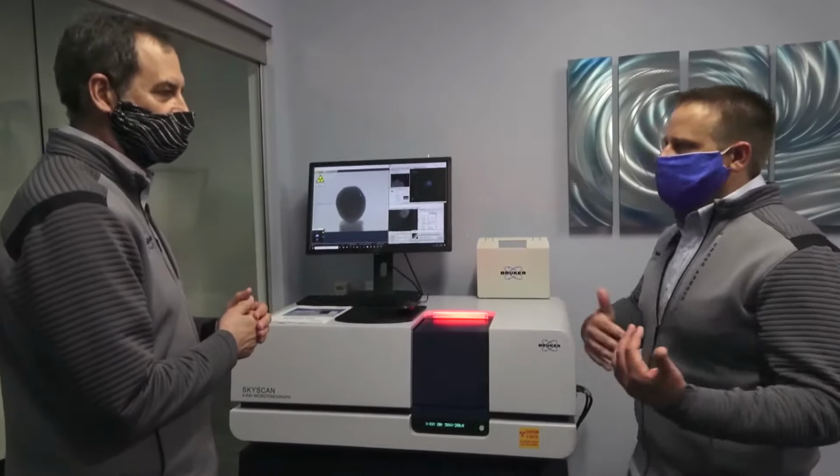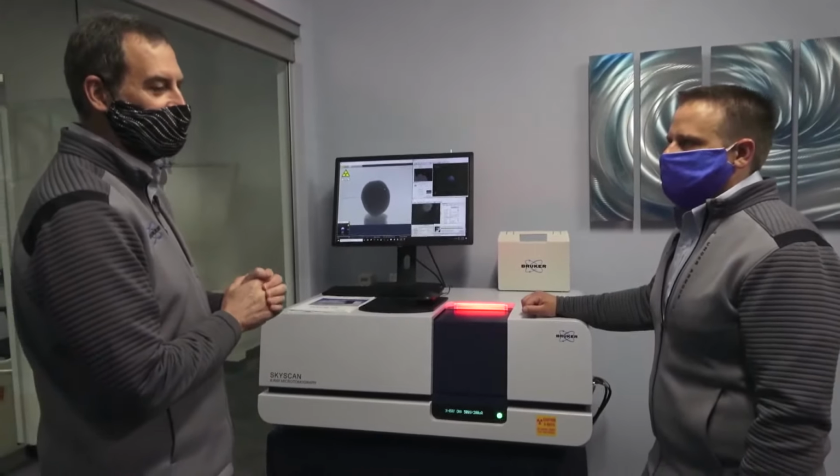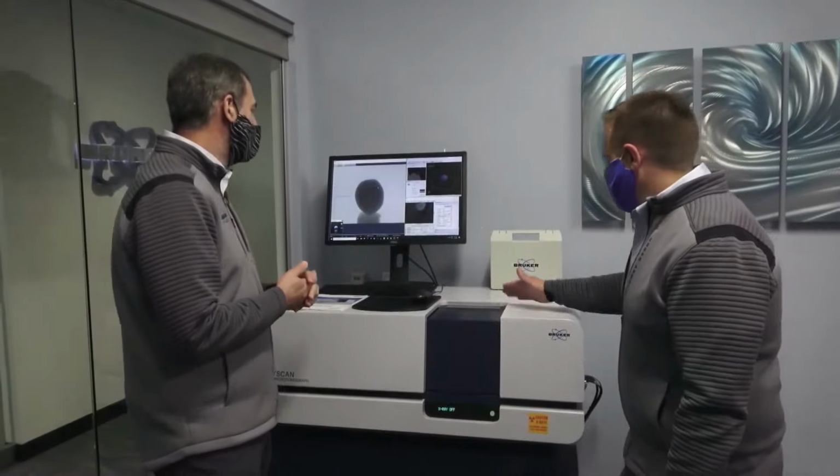Okay, and then the larger machines, I'd imagine you can go higher. This one, the big SkyScan 2214, can go up to 160 kilovolts. It's got a little bit beefier X-ray source than this one. So a little bit more punching power. Exactly. So it looks like the light turned off.